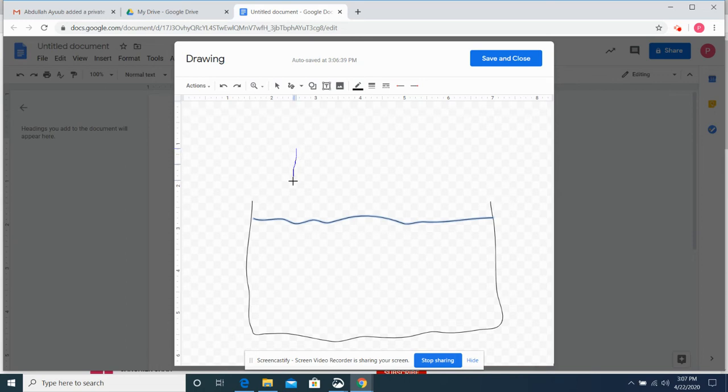Into your liquid, you're going to put the electrodes, or the person in the video is going to put some electrodes. All right, so there's one. You have to have a positive one and you have to have a negative one. So there's going to be two. They're made out of carbon. They're just black rods. And one of them is going to be positive and one of them is going to be negative. So I'm just labeling it positive and negative here. So this is the positive electrode and this is the negative electrode. It doesn't let you make sideways lines very easily.